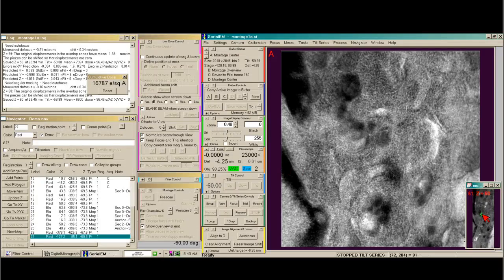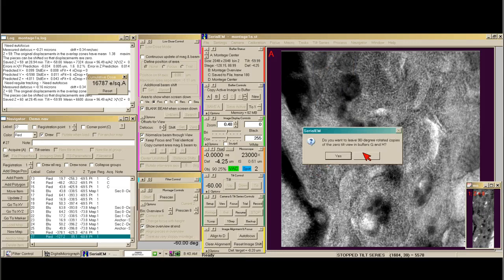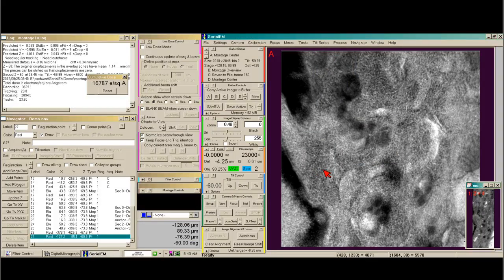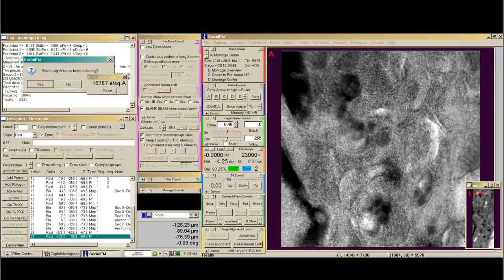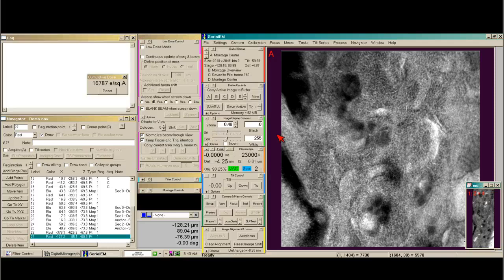Now that the tilt series has finished, we can look at our extra output window and movie through it using the page up and page down keys, to make sure the tilt series is fine. It looks totally reasonable. So now we go to Tilt Series Terminate — yes, we want to terminate, but no, we don't want to save any rotated images for the B axis. Then I always tilt back to zero just for the safety of the copy stage. Then we close the log file and open a new log, which will be ready for the next tilt series.